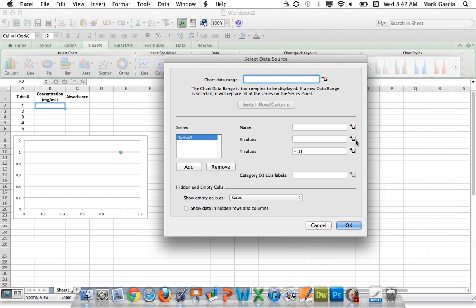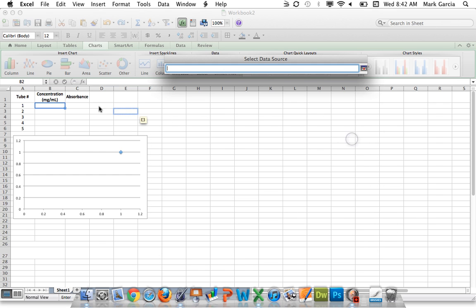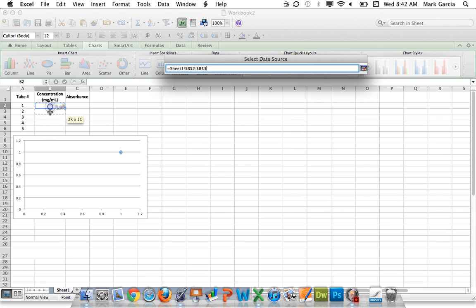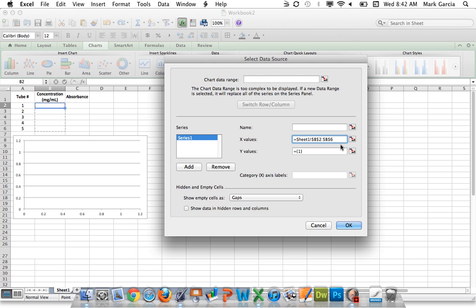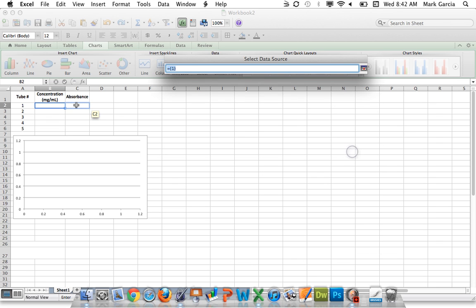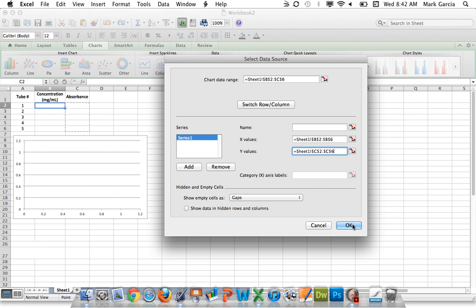I don't really care about the name of the series or anything like that at this point. I just want the correct X and Y values. I'm going to click here on this tab for X values, and for my X values, I want it to be B2 through B6. I click this tab again to bring me back into my chart options. For my Y values, I'm going to select C2 to C6. That's going to give us the correct values. I'm going to click OK.